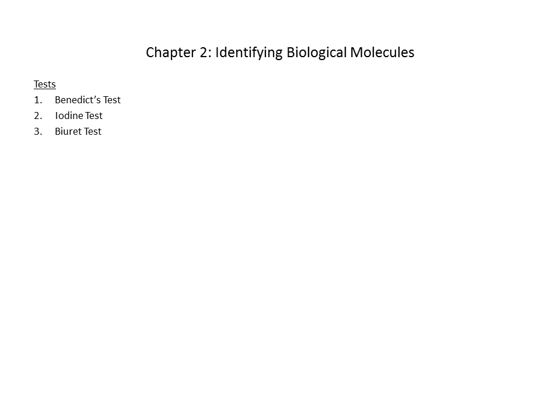All right, here it is. Here are our three tests. I don't know if that's the order they actually end up in this presentation, but let's say at the outset you need to know what their name is, what they test for, how to actually perform the experiment, including what reagents go into which mixture and how much of each unknown goes into each mixture. And then another thing you need to know is what the results actually look like.